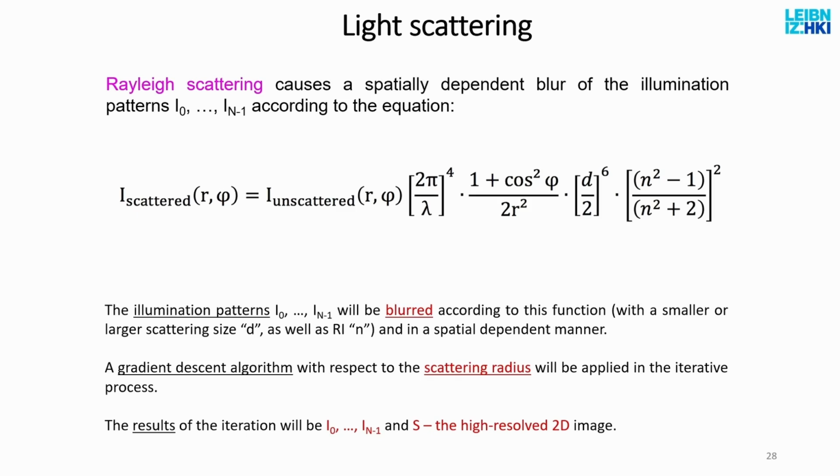And this is actually useful because you can turn this into a measuring device where you illuminate your molecules distributed in a colloid solution with a laser, and you measure the scattering pattern. And you can then calculate the diameter of the molecules.